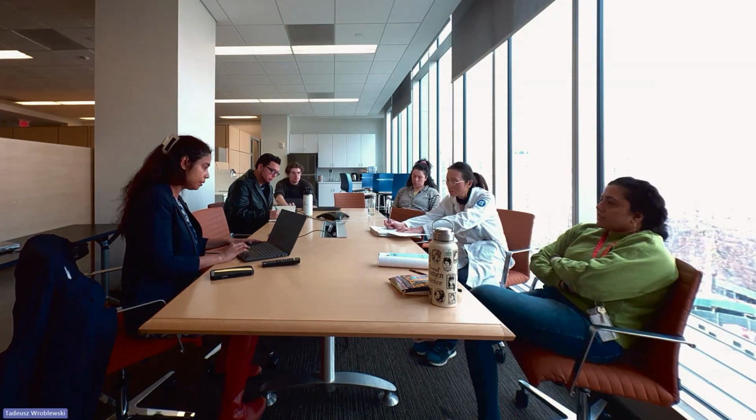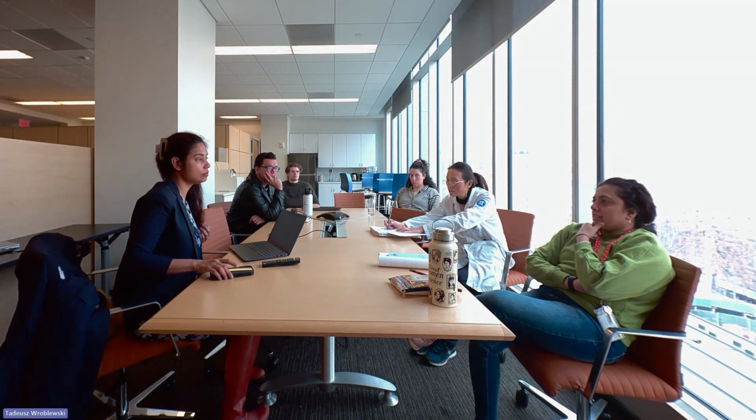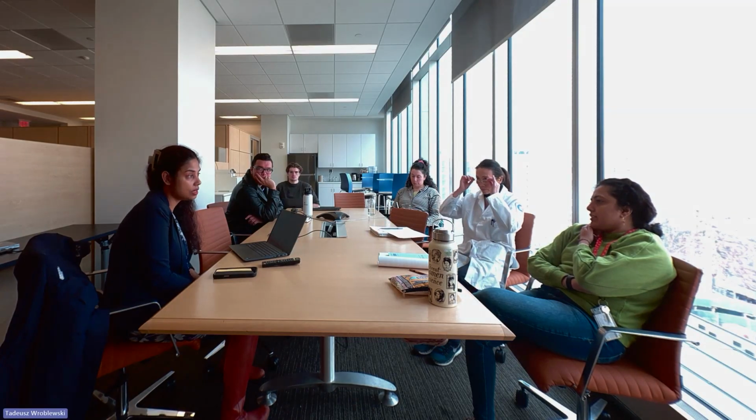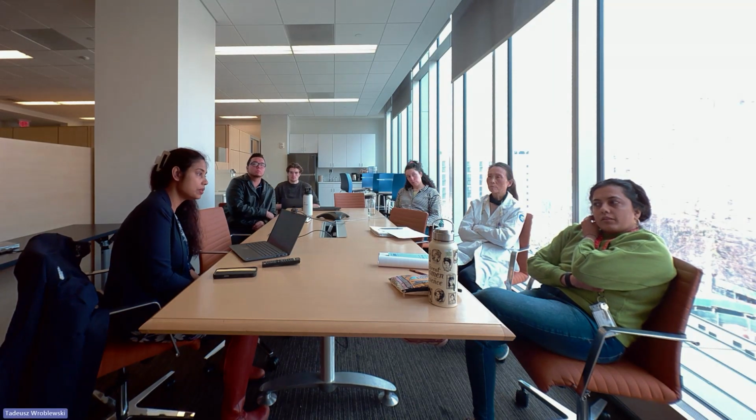We were discussing genomic contamination and how we can get rid of it. One of the ways we were thinking about is size selection. Yeah, you can do that. I cannot guarantee whether it's going to help, because this is something I am doing for the first time. Nanopore has not done CSF cfDNA, so from Nanopore's side, I don't think we can guarantee anything. But if I think about it, I feel like I would try that. Maybe it will help, but not sure.